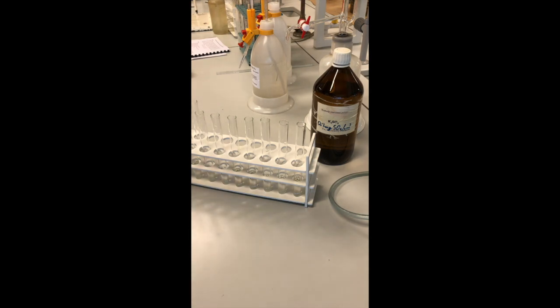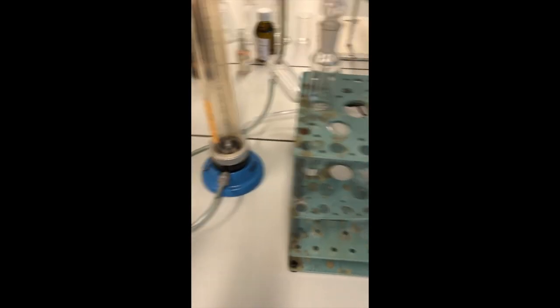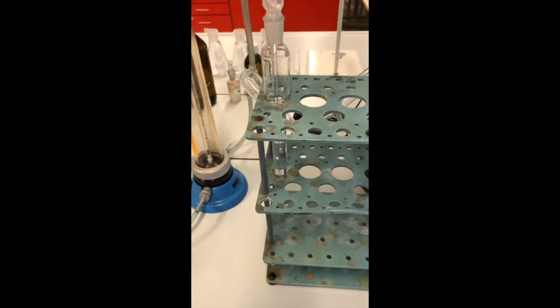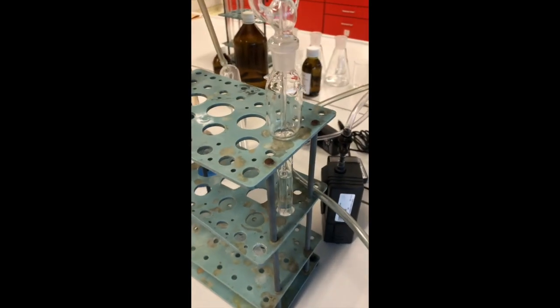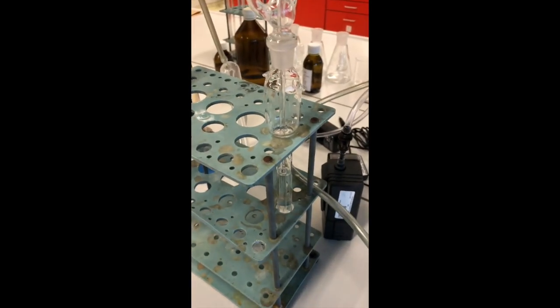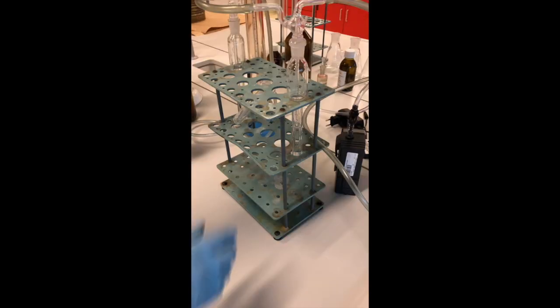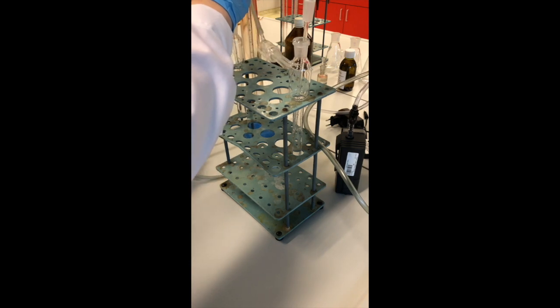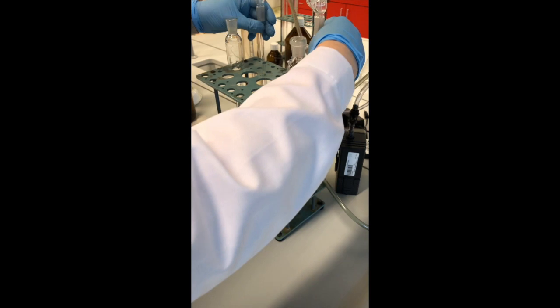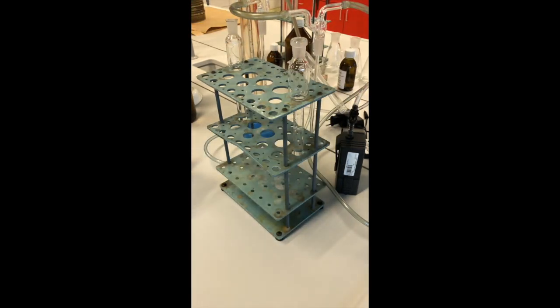We can say that the same type of solution is in the scrubbers. So what we have to do now is take 5 cubic centimeters from each scrubber and then prepare the sample. So we take separately from each scrubber.